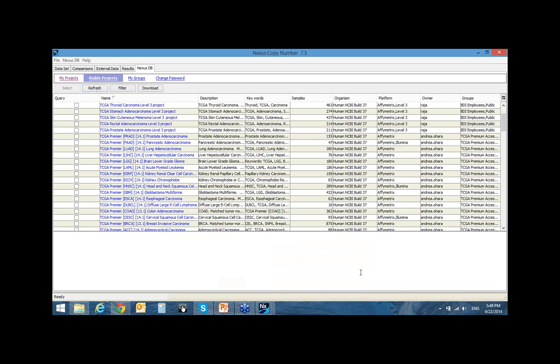All right. Does Nexus also support all kinds of Illumina arrays? Of course, the answer is yes. The Nexus software supports all kinds of array platforms. Since today is the Affymetrix joint webinar, I'm focusing on Affymetrix arrays, but it does support all other arrays, including Illumina, including the NGS data for copy number analysis.